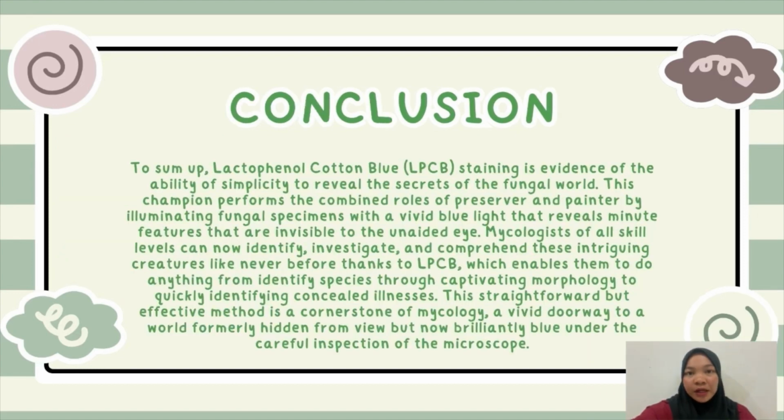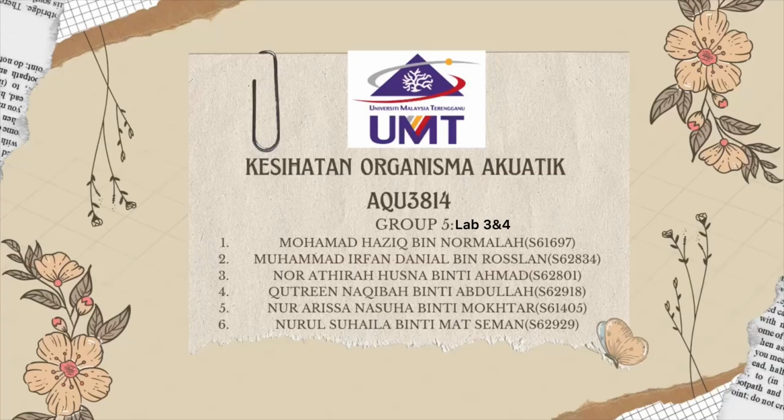To sum up, lactophenol cotton blue staining enables mycologists to identify and understand fungal species, morphology, and disease through vivid blue light, making it a cornerstone of mycology.